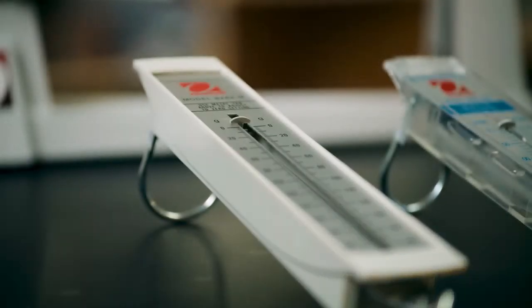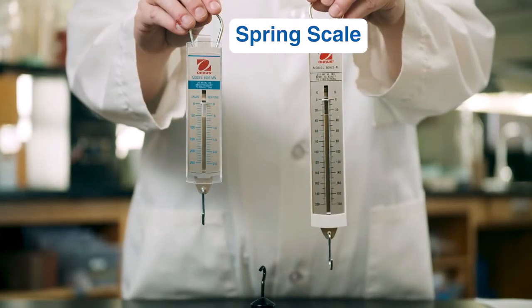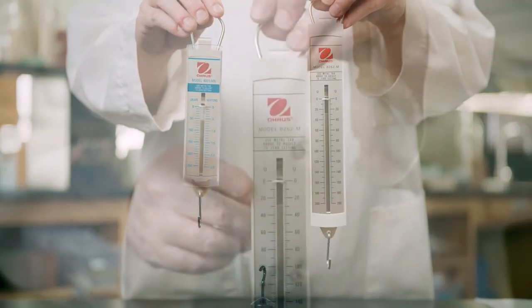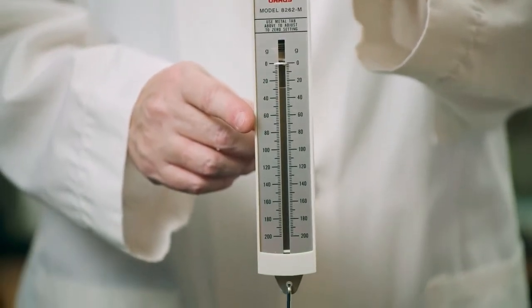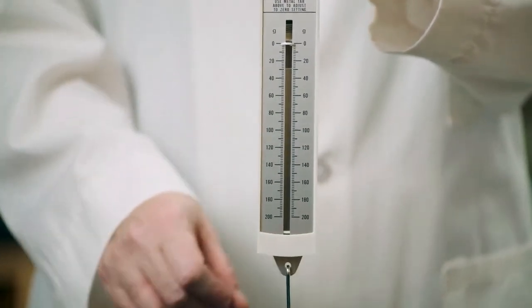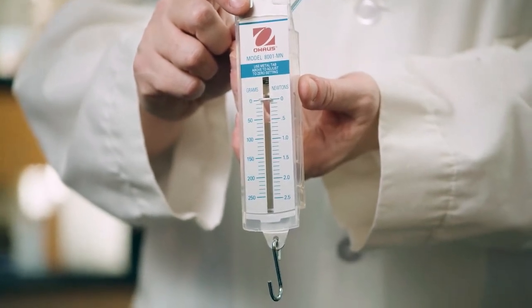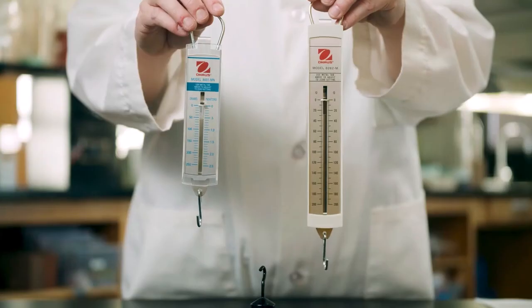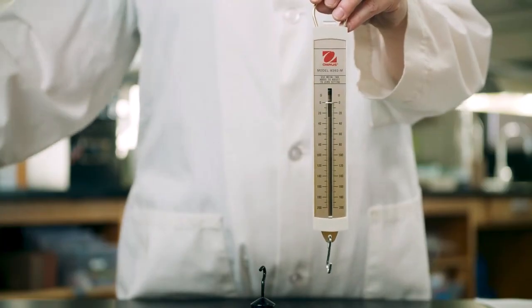A spring scale can show measurements in grams like a triple beam balance. However, a spring scale actually measures weight. A spring scale is used when you want to measure the weight of something that can hang from a hook. Examine the increments on the spring scale. This spring scale measures in 2-gram increments. However, this other scale also measures a maximum of 250 grams, but it measures in 10-gram increments. For this demonstration, we will use the scale that measures in 2-gram increments.